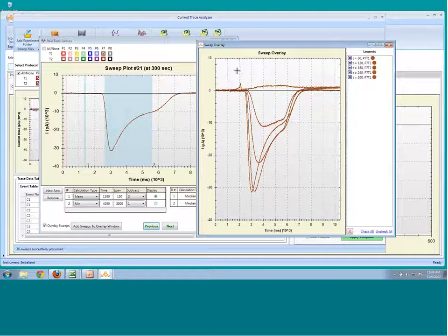And then I could choose to export this entire thing, or alternatively, within all of our windows, we can simply right-click and say, copy this image. So if I'm adding notes, I could simply add this to my notebook file.